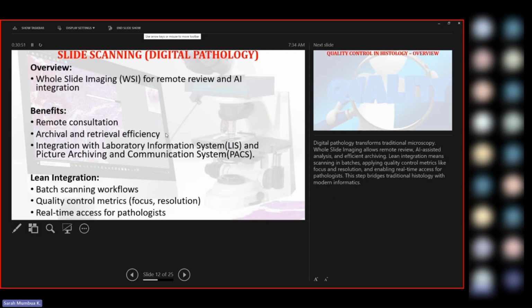Remember, you're doing all these processes. It's not like you're doing the donkey work, but you're doing actually the technical part. So the pathologist is going to do the review of the slides. And this one, you make sure you arrange them in numbers, in order. Remember, the very number we gave the tissue from sample reception is the number we gave at the tissue cassette, is the number we are giving at the slide. So I make sure that these numbers are exactly the same, are matching completely.